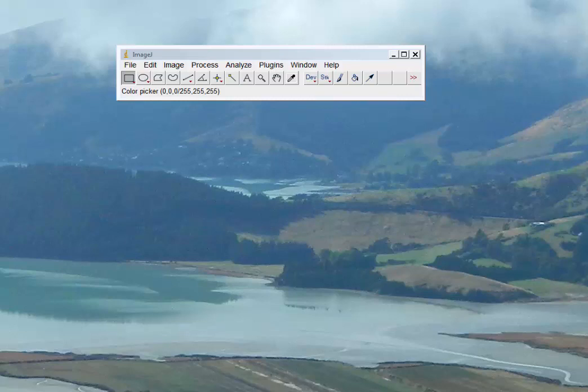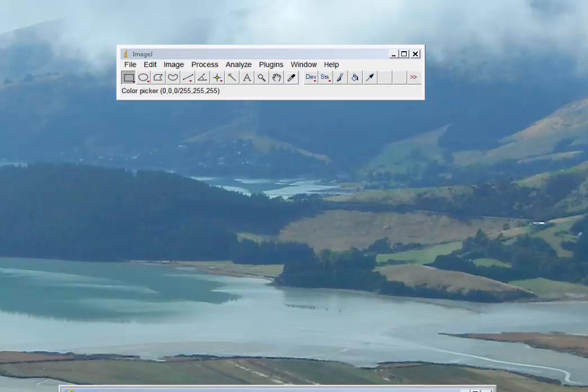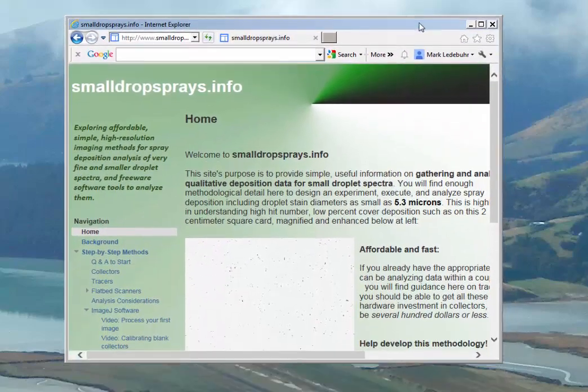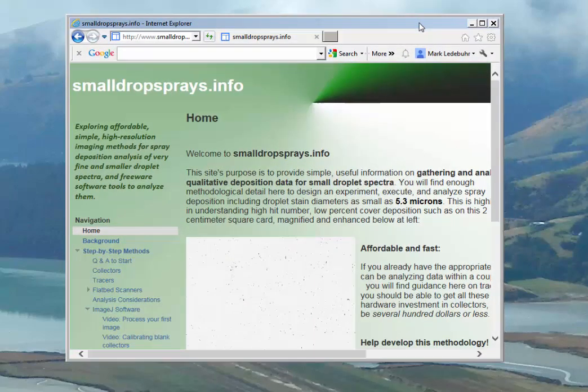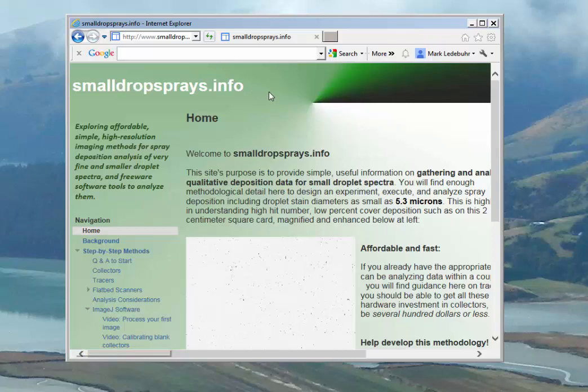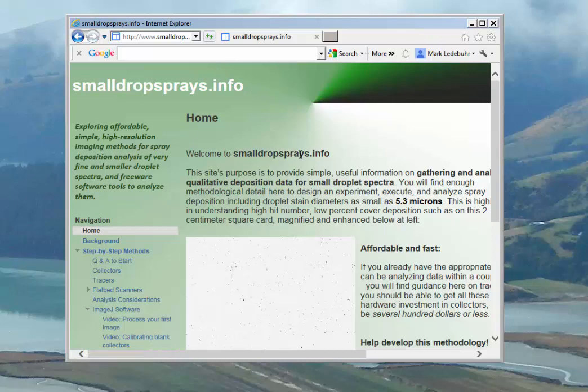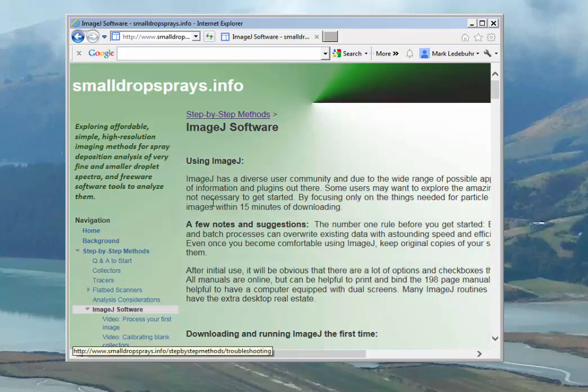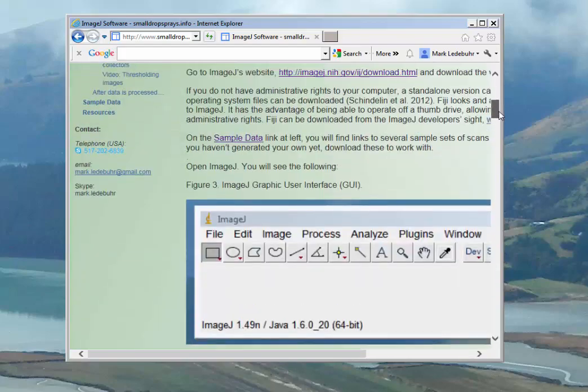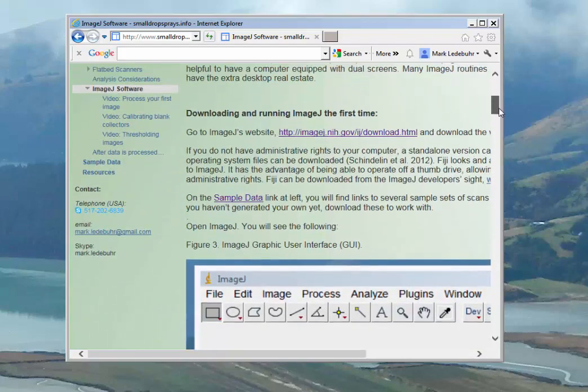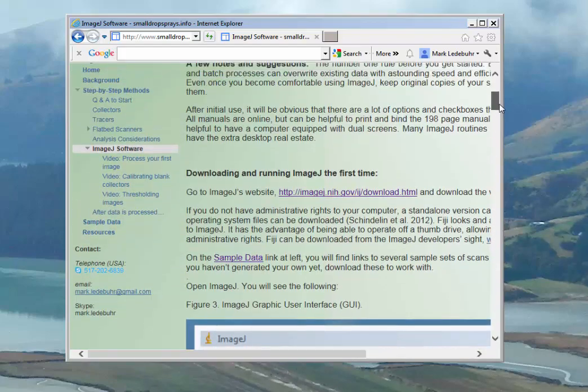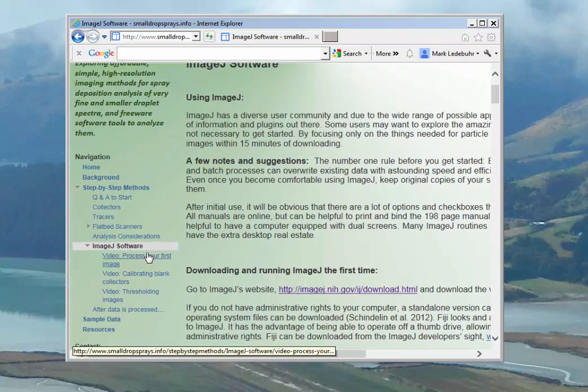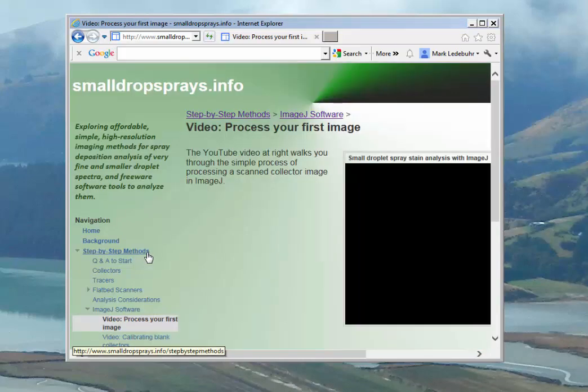Before we get started, I'm going to assume that you have already been to the smalldropsprays.info website and downloaded ImageJ, which you can find on the ImageJ software page. Then you should go to the tutorials on running your first image. You can find a video for that here.